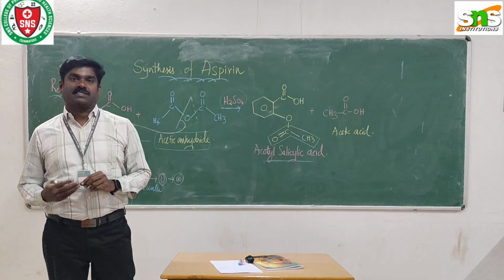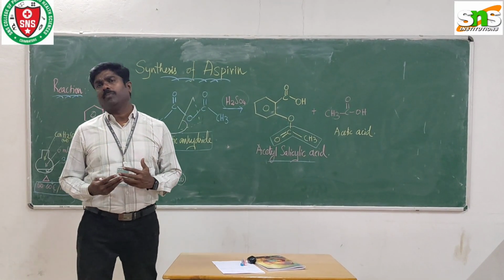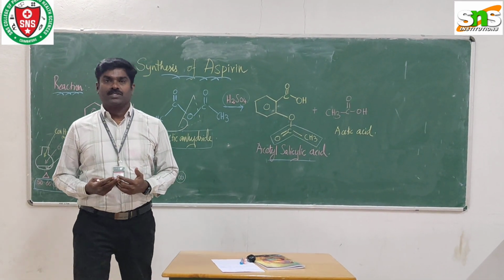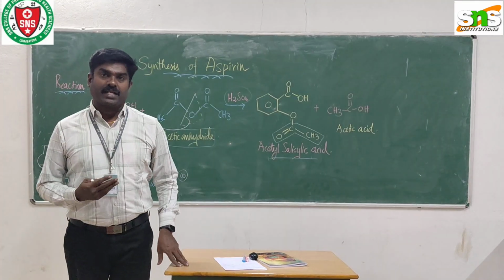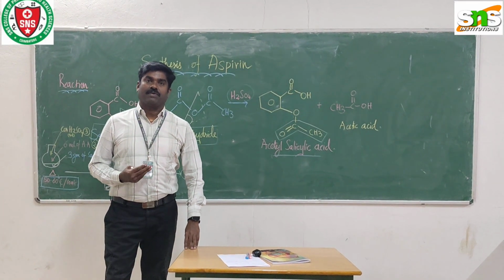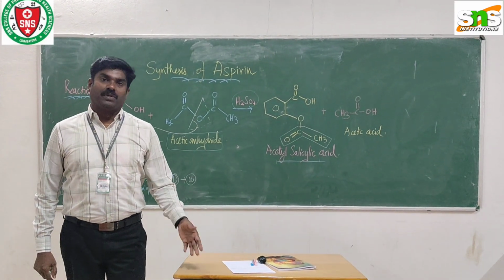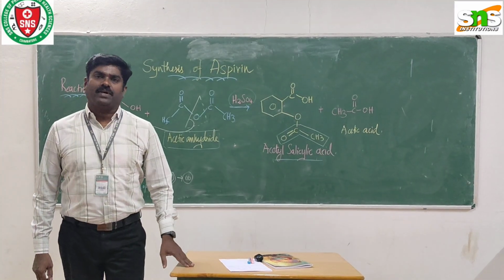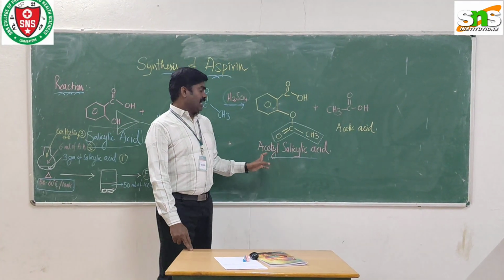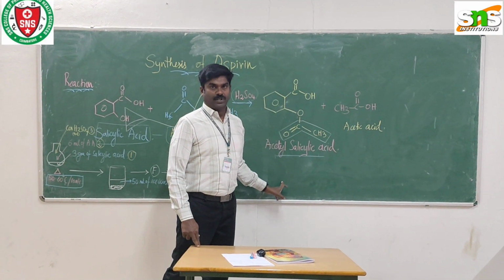Once the synthesis is done, we need to dry the compound properly, then weigh it, then pack it. Before that, after drying, we need to perform a qualitative analysis. The identification of aspirin is very important. What method we are using and how we can identify aspirin, I am going to explain now. This is acetylsalicylic acid, and the synonym is aspirin, we know.